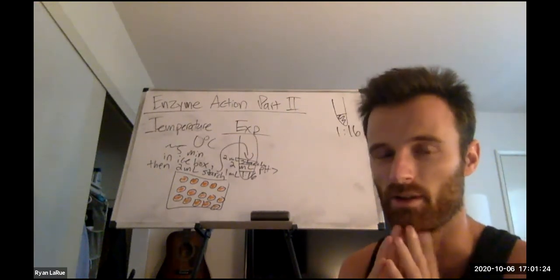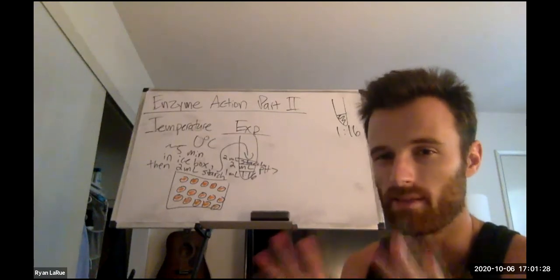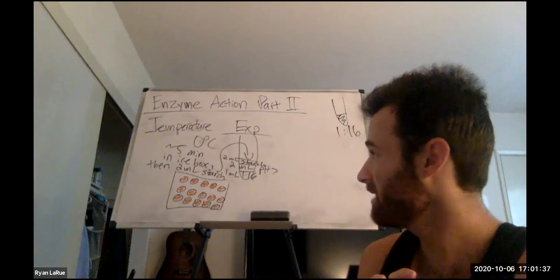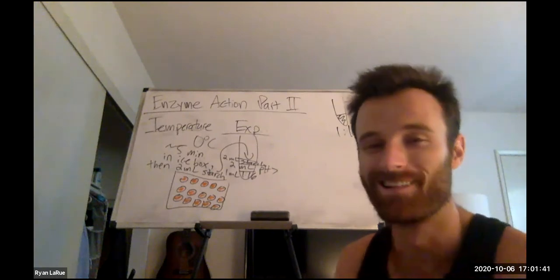Yeah, you don't have to worry about why we have the buffer, but it has something to do with maintaining the pH. I think saliva is slightly acidic maybe. It's a good question though. I do know that's what buffers do.